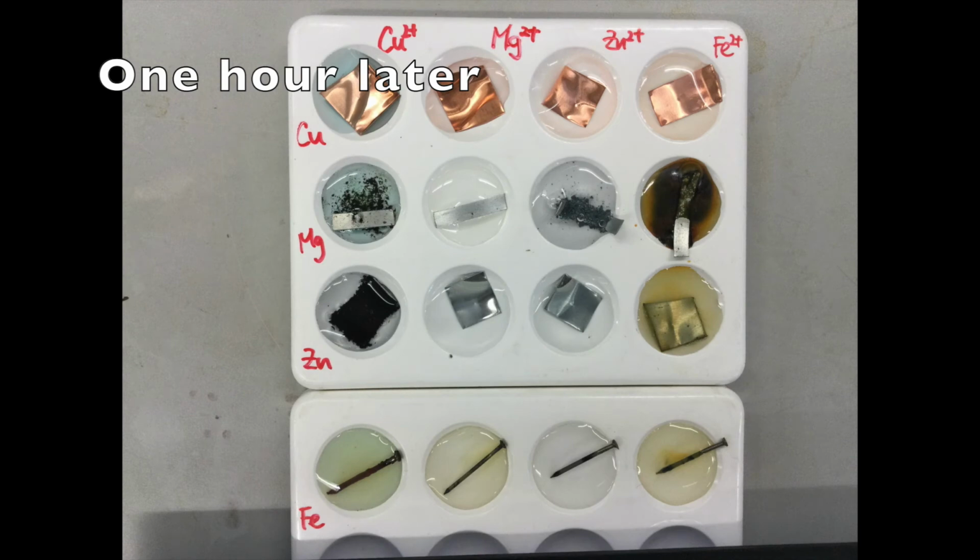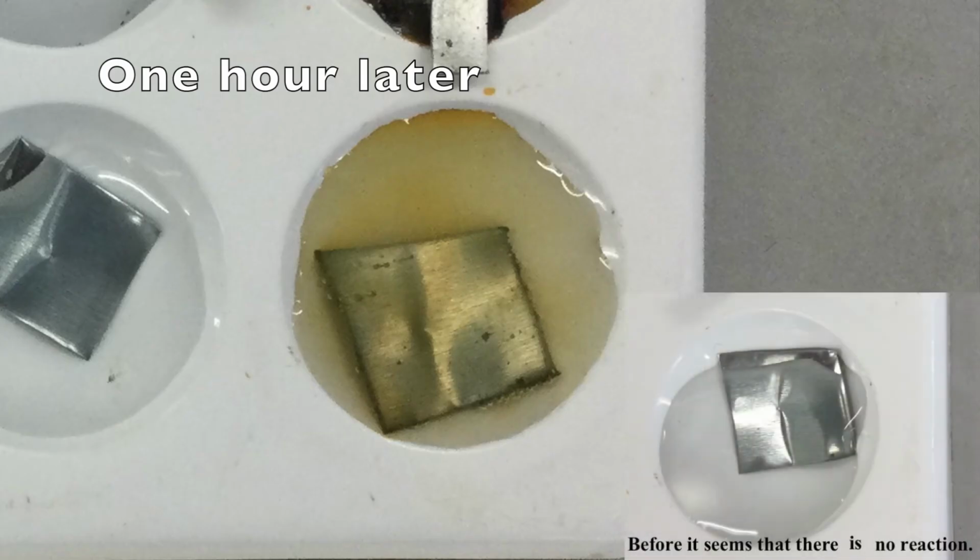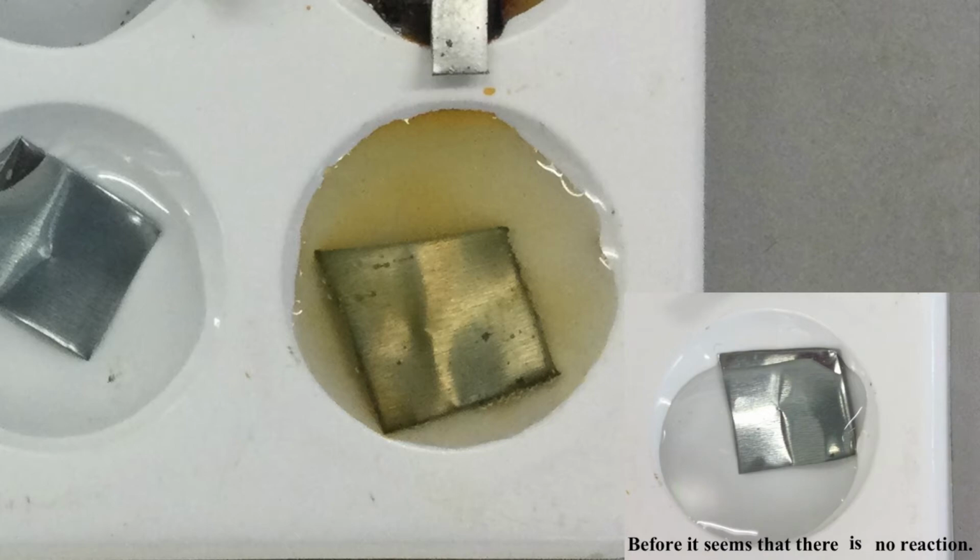This is how the wells look after 1 hour. It is observed that both magnesium and zinc give reddish-brown solid in copper-2 sulfate solution. This is zinc in iron-2 sulfate solution. Before, it seems that there is no reaction, but after an hour, we can see that black solid is formed on the edge. That suggests that a reaction has taken place between zinc and iron-2 sulfate.